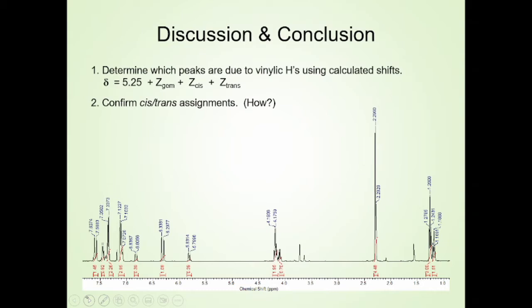Remember coupling constants? So for each peak, you will determine the coupling constant. So for example, if this is one of the isomers, you would simply take the difference between those two peaks, 5.8314 minus 5.799, I think that's an 8. Nope, that's a 6. So you would simply subtract these two numbers, multiply by 400.